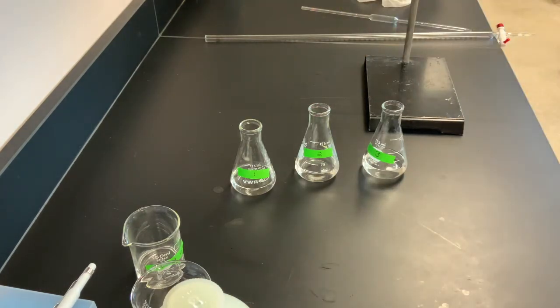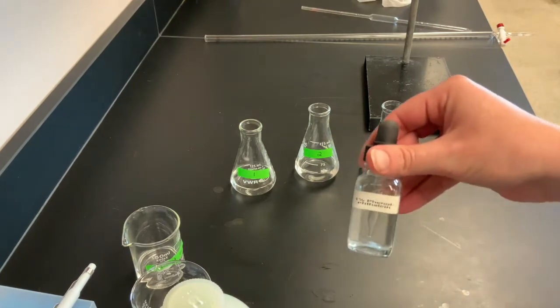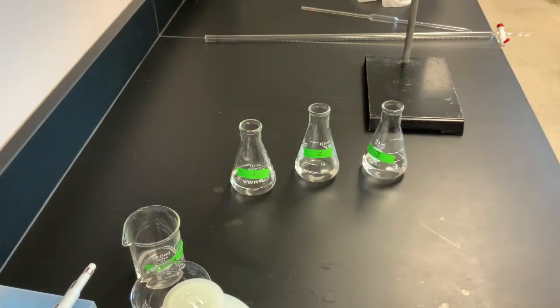So now to each of these containers, we're gonna wanna add some phenolphthalein. Remember that phenolphthalein is our indicator? And that phenolphthalein is going to change color when we reach the end point for our titration. We're gonna add just a few drops to each of our flasks.